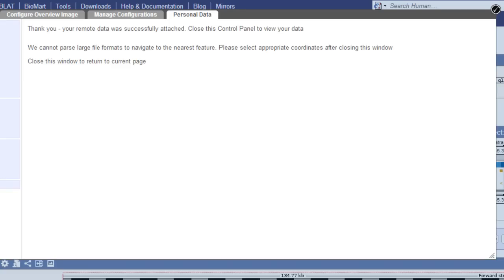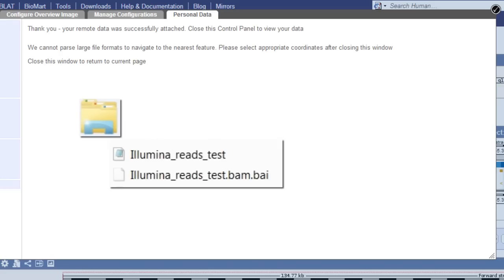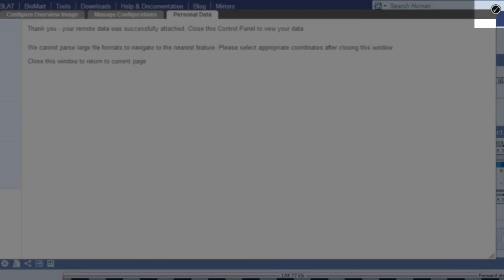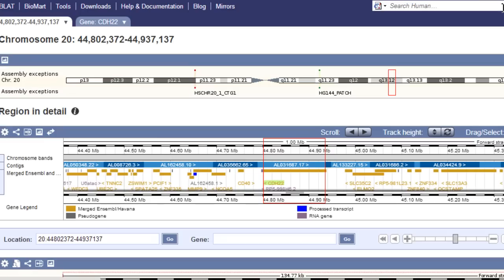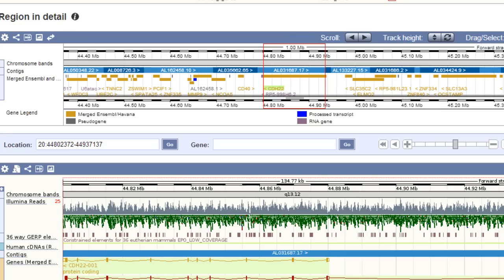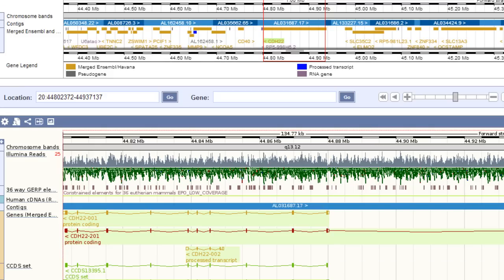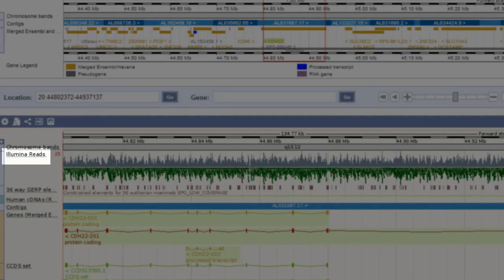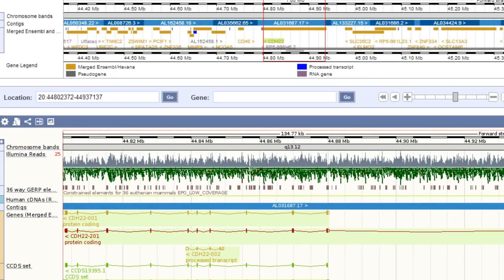I actually don't need to attach the index file. As long as it's in the same directory as my BAM file, Ensembl will find it. So I can close the menu now to see my Illumina reads. The track name is Illumina Reads, as I specified during the attachment process.